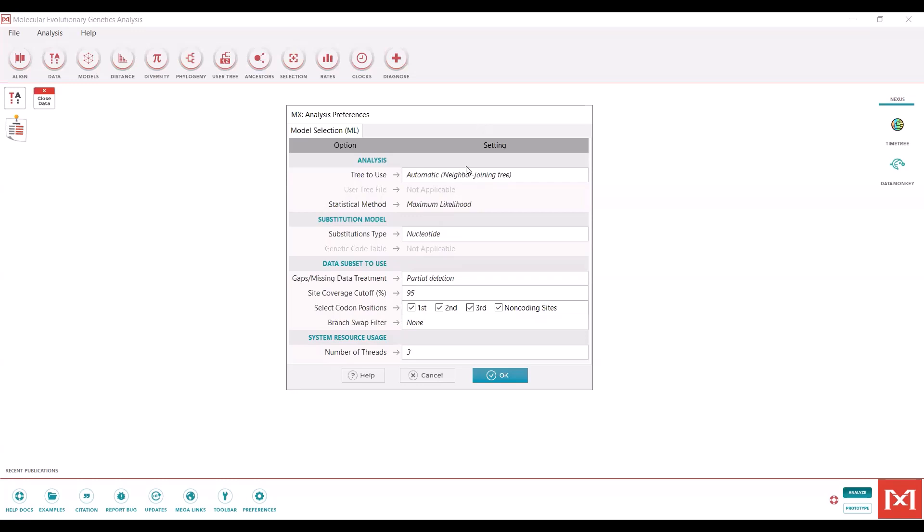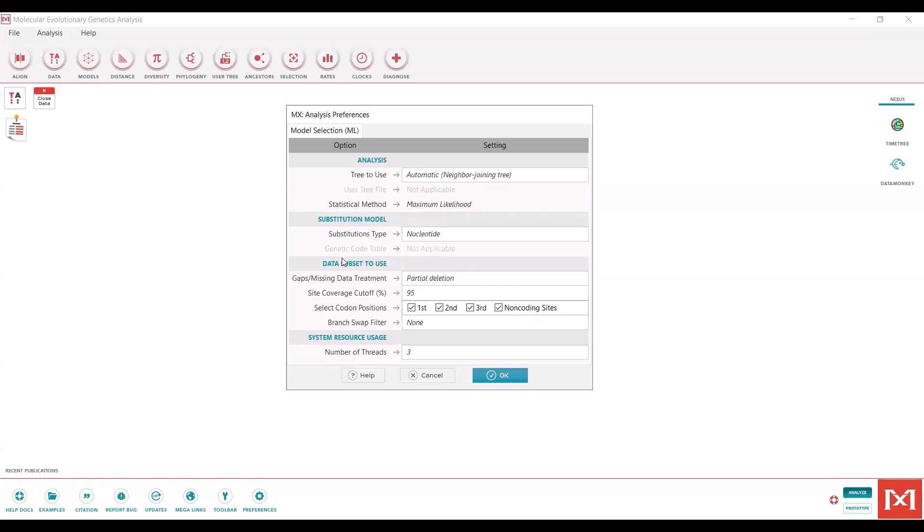We're going to start from an automatic neighbor joining tree. We are going to look for the best nucleotide substitution model as opposed to the protein model. And this is what I was talking about here.